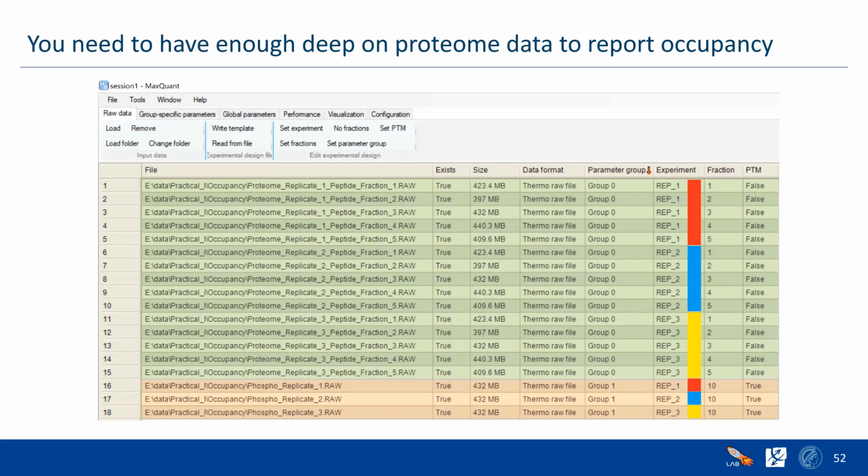And when you also do label-free for your phosphorylation studies, you need to have a reference sample that is different. You shouldn't choose a similar one, otherwise you will have error propagation related issues in your occupancy calculation, which we avoided with estimation, but still on the LFQ you need to find a reference much different from the others.